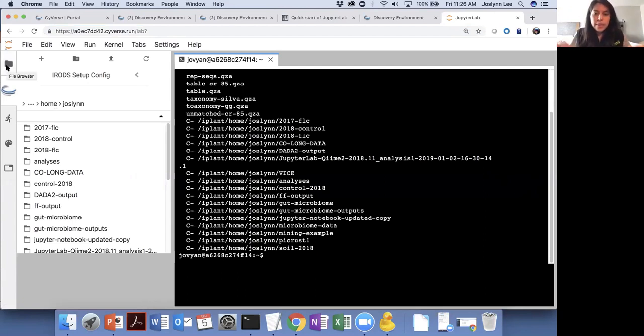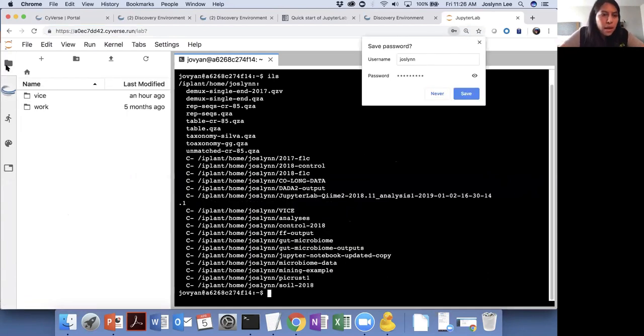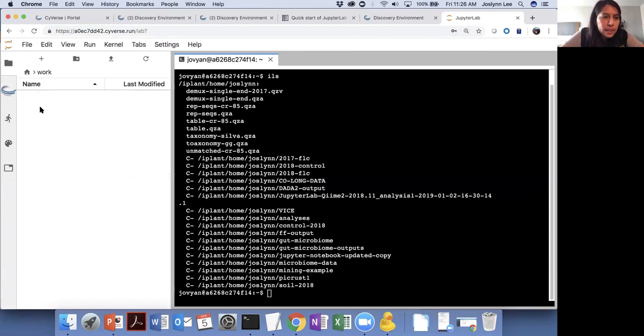So now that we're connected back to the data store, let's actually see what a Jupyter notebook looks like. This icon on the left is your home. Once you log into VICE through DE, all of this is going to be housed in the VICE folder. So this file system can be a little bit tricky to get used to, but once you play around, it makes more sense.